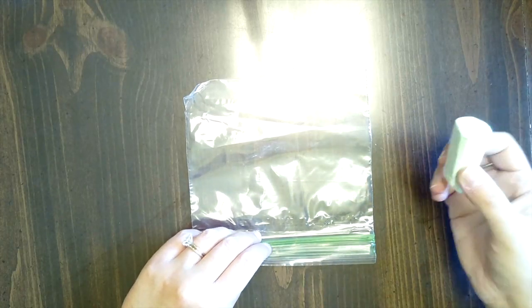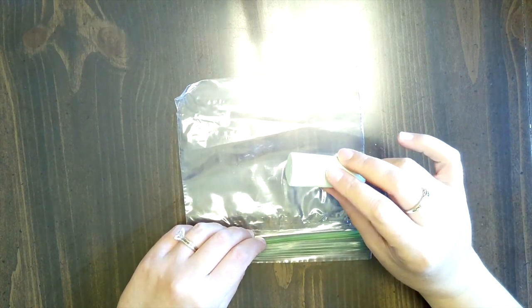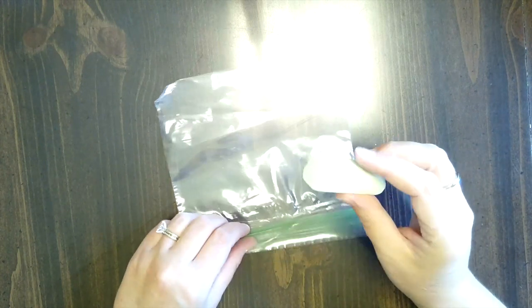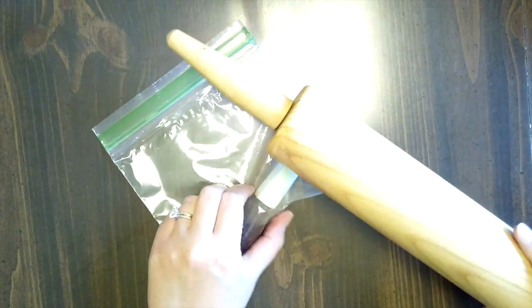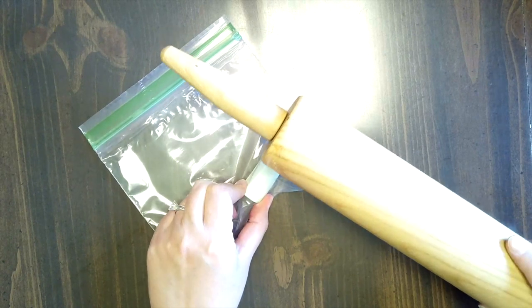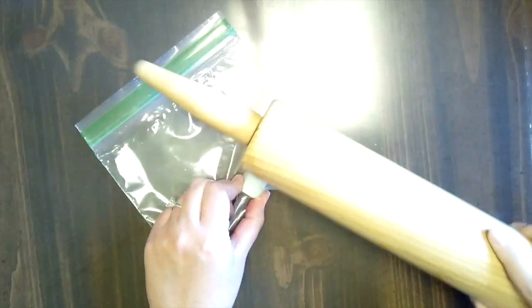So the first thing we're going to have to do in our lab is we want to get our little piece of chalk that has that calcium carbonate in it into powder form. So the easiest way to do this is to put it in a little plastic bag, make sure it's sealed very tightly, and use something like a rolling pin, or you can even use a can to quickly kind of bang on it and grind it up and get it into a powder form. So we'll go ahead and do that really quickly.